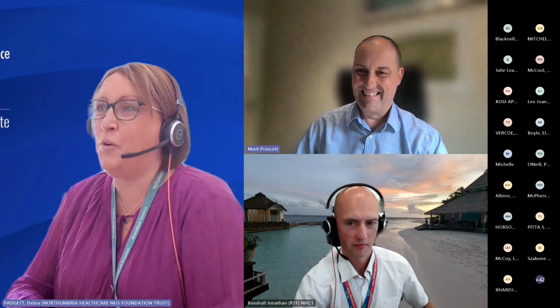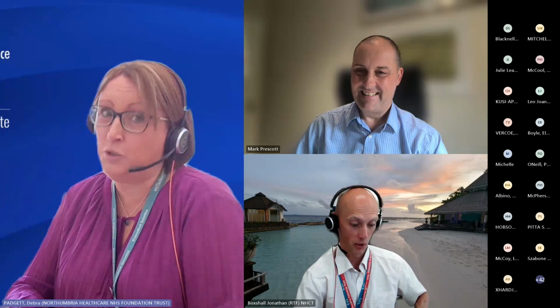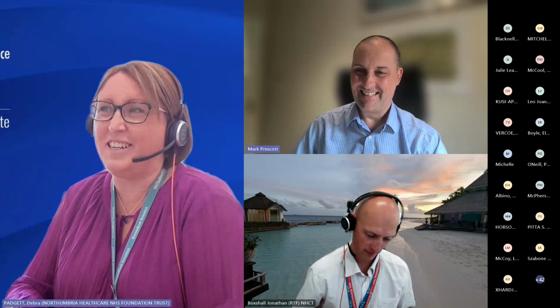I'm going to answer this one first and say not only can they, but they should be helping with validation and verification of equipment and processes in the department, as should anybody that interfaces with that equipment or process. But the magic words are, as long as they are trained and competent to do so. And that's the important bit. Mark, Jonathan, do you want to add anything?